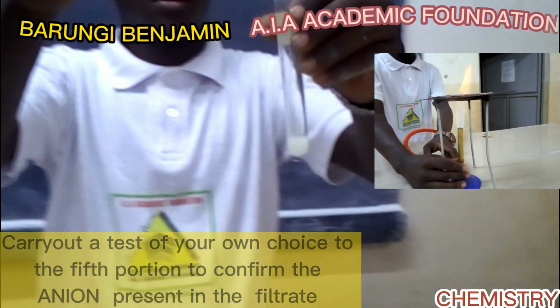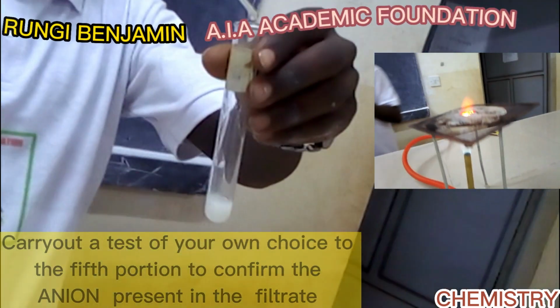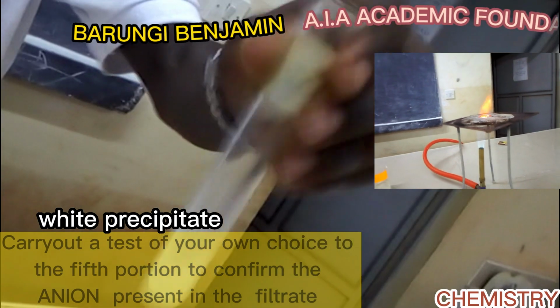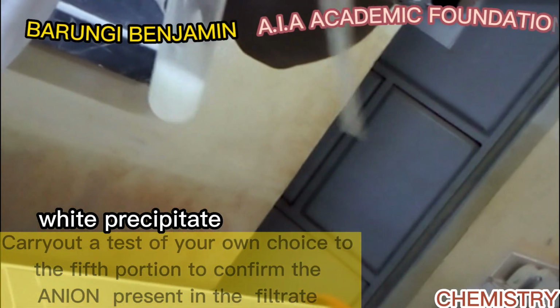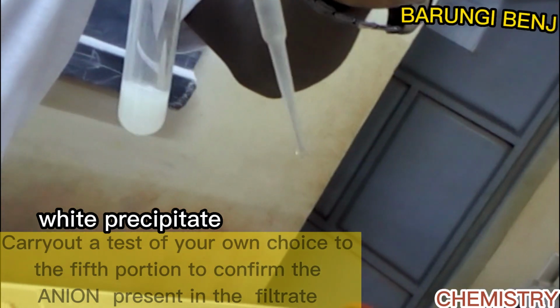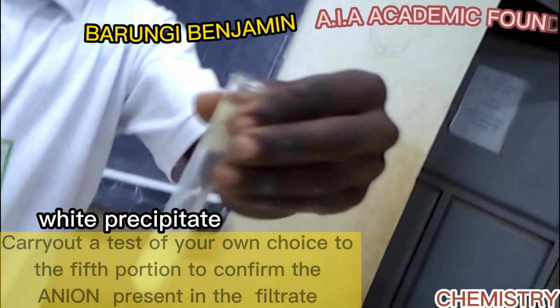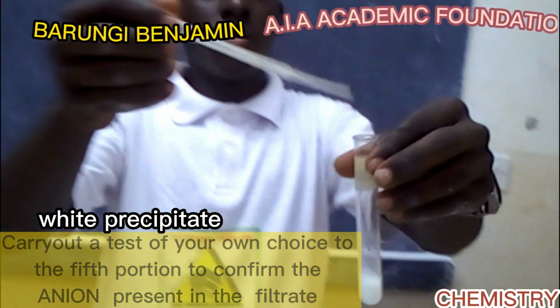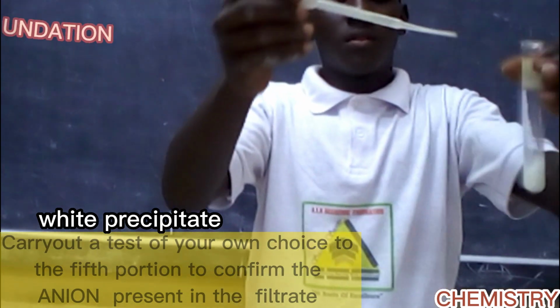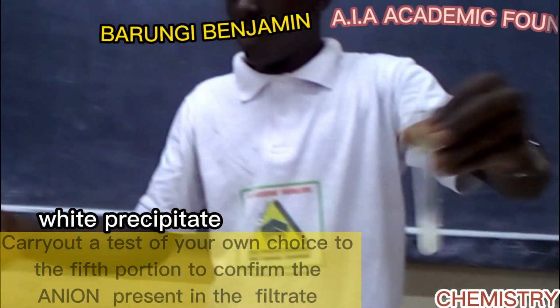As you can see, sulphate ions form a white precipitate with barium nitrate. And our white precipitate is insoluble. See? It's insoluble.